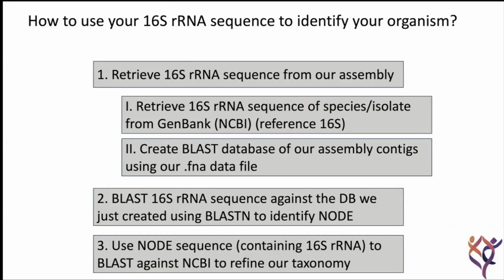You need to take notice of where this program is downloading to, because you may need the pathway for future operations. We want you to be able to take your own genomic data and to retrieve the 16S sequence from it, and then compare it to the literature and recreate as accurate a phylogenetic tree as you can in order to be able to identify your organism.